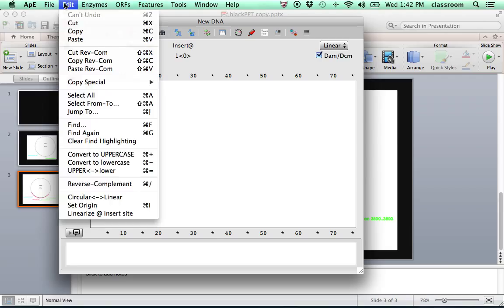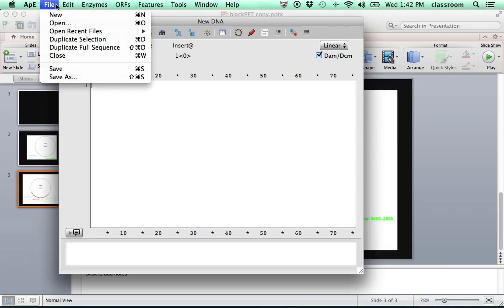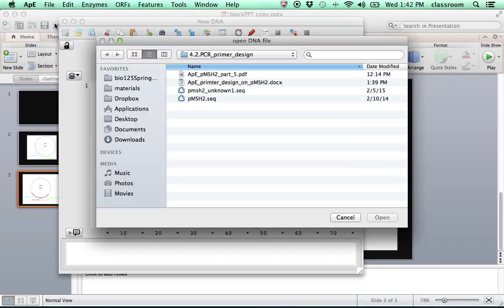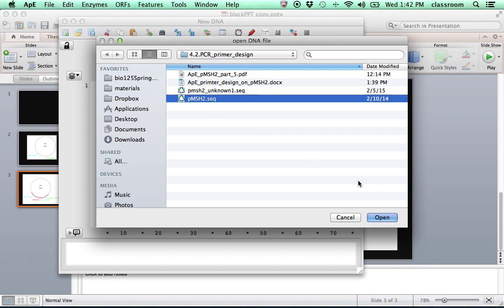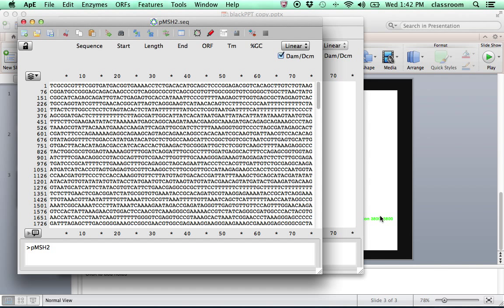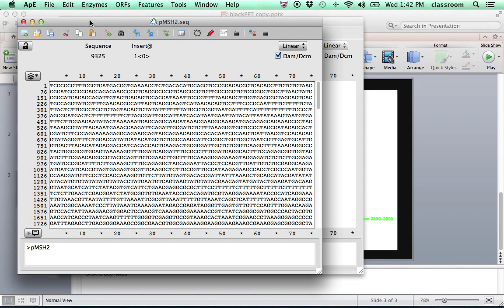So first, go to open APE. Go to File, Open. Open the sequence file. In this case, we first start with the pMSH2.seq file. So this is the plasmid DNA file that carries the MSH2 gene.